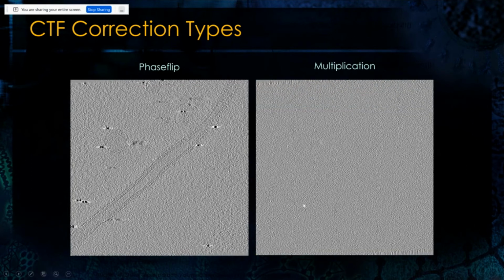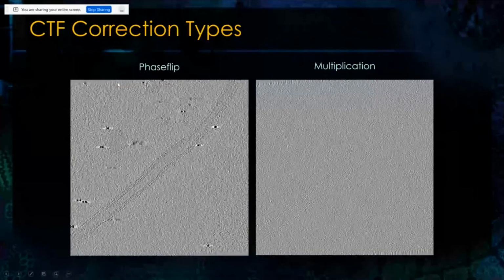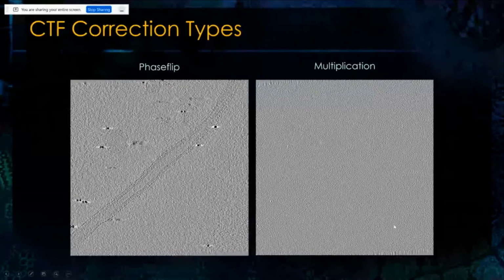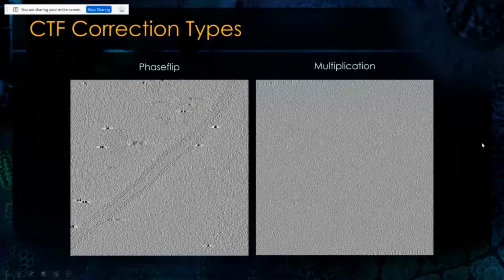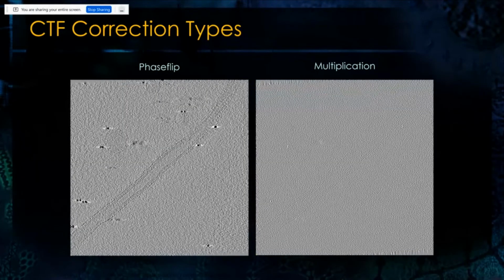as long as you can still see at least a bit of the removed beads and the structures, and you know that, for instance, here this is a bit of the cut off from alignment, that if it's there, these are not artifacts. This is just how it looks when you boost the amplitude using multiplication in the correction. So even from this kind of data, we still got this 3.4 angstrom structure. So you don't have to be worried that something is wrong.